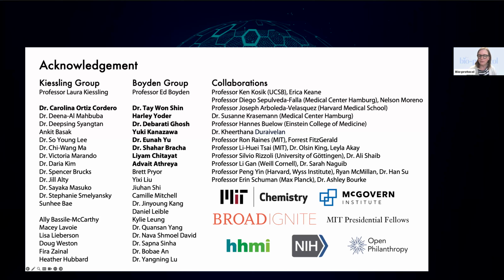Has anyone tried this in plants, cells, or tissues? I don't know if anyone has tried this with plant cells. That's a great question. If you want to try this on plant cells, I'm happy to talk more. It will depend on whether people have used expansion microscopy with plants and what modifications they did, and then we can think about what modifications we can make to this protocol. I presume it might require digesting the cell walls.